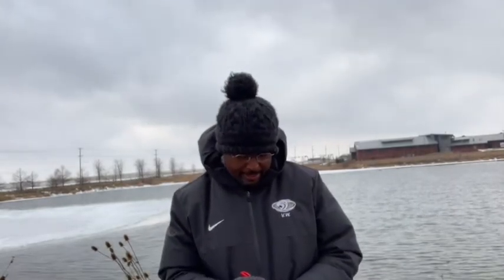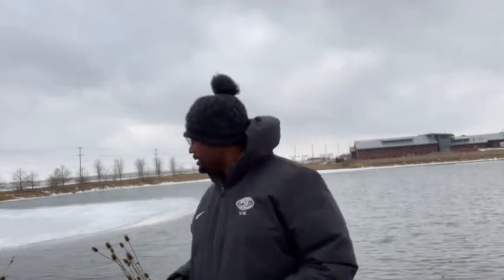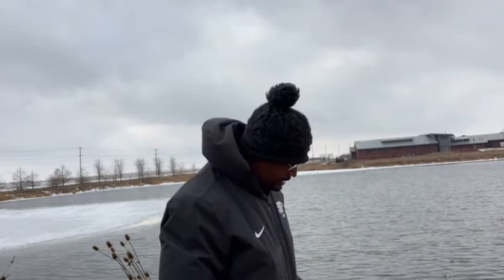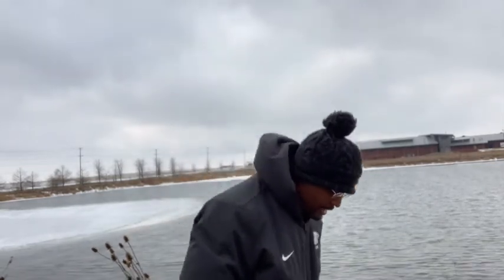So I'll make a note of that. And then I will walk about 10 yards. I'm going to go 10 yards to the north, and I'm going to put my probe in the water again and see what the temperature is there.